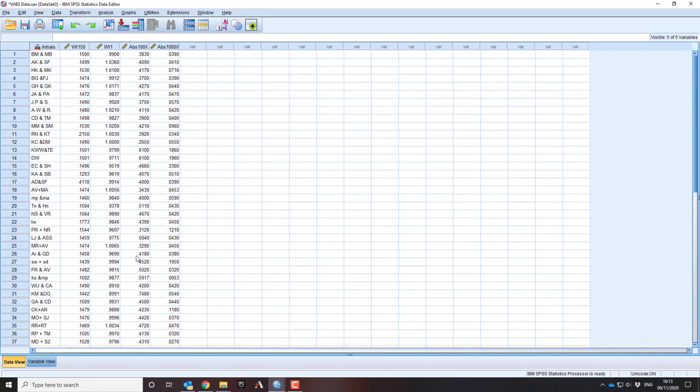This leads you to be suspicious that there's some kind of systematic problem with that particular set of data. It can't be that 1 or 2 people are just misusing the plungers in the pipettes or haven't got very good technique. This is across everybody within the class. You're finding it's underrepresented data above 1.